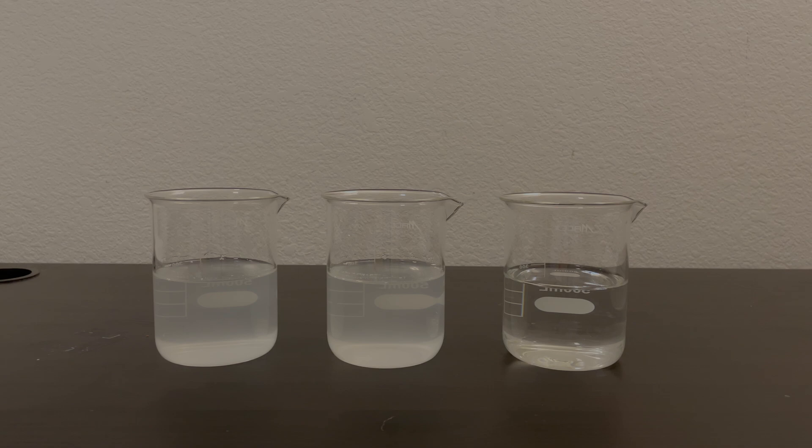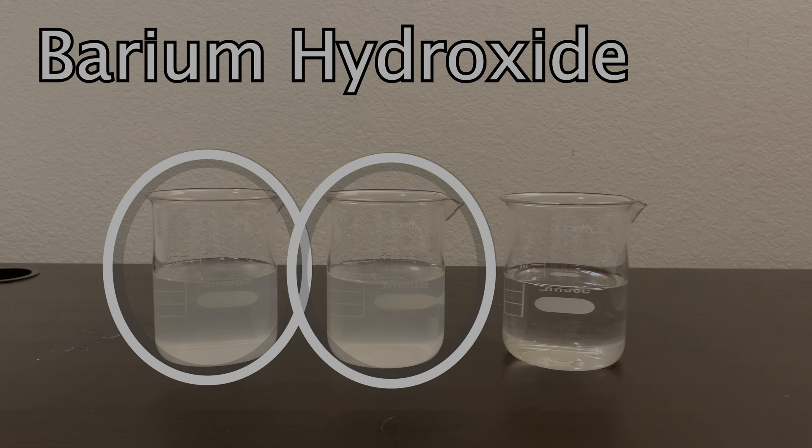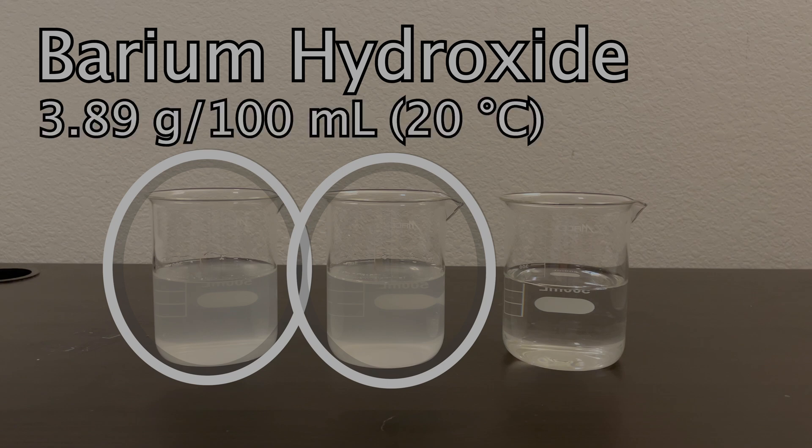As a side note, the reason that the solutions in these two beakers were so cloudy to begin with was that barium hydroxide doesn't dissolve very well in water. It is technically soluble, but only at a rate of a few grams per 100 milliliters. So, it does take quite a bit of patience to dissolve it.